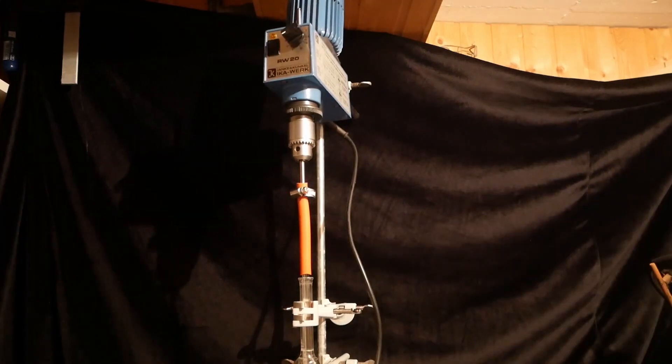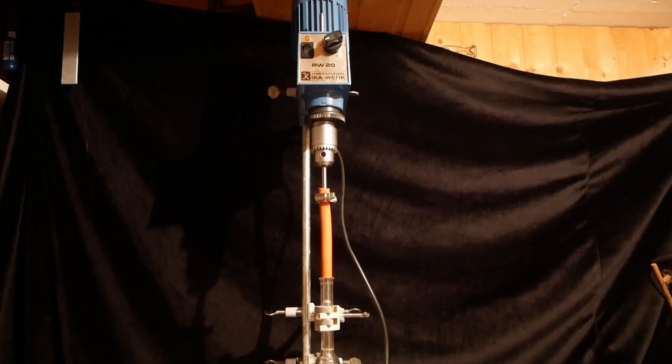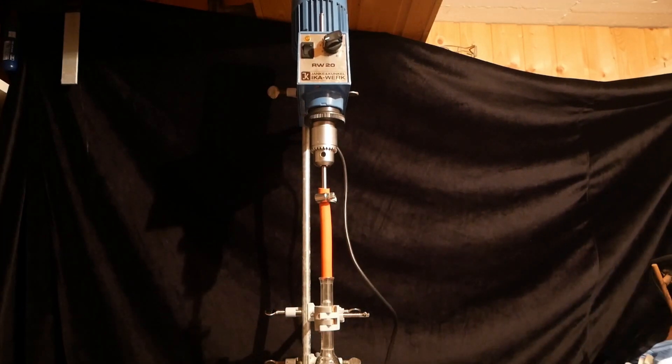Perfect alignment is very hard to achieve, so a rubber tube is placed between the motor and the stirrer to give a bit of flexibility to the connection.